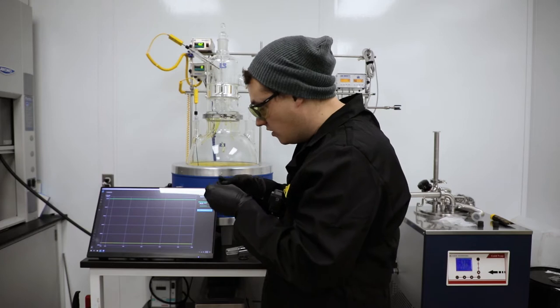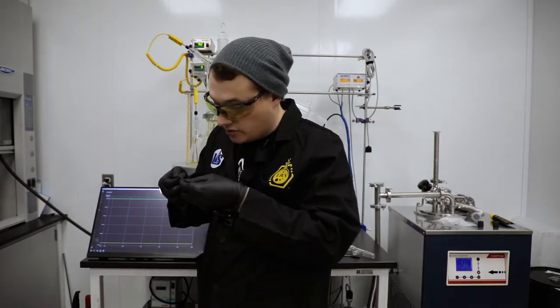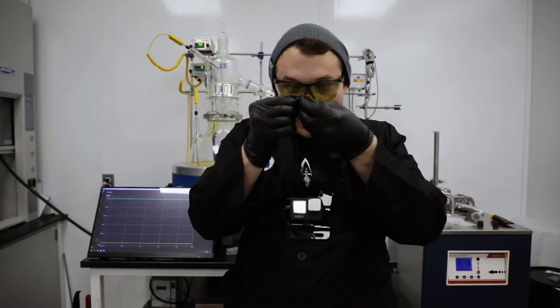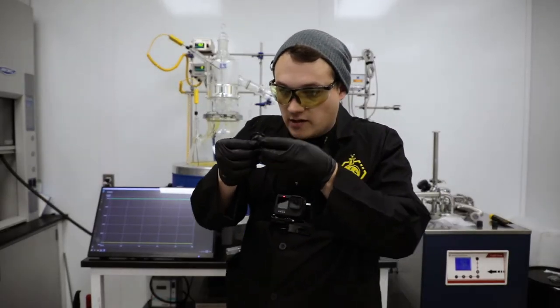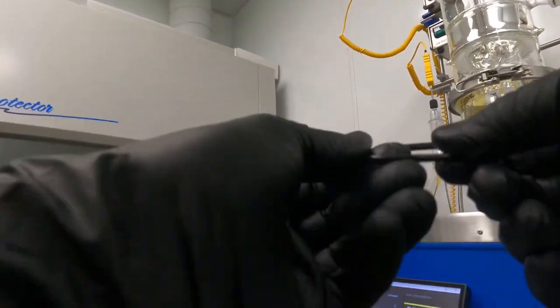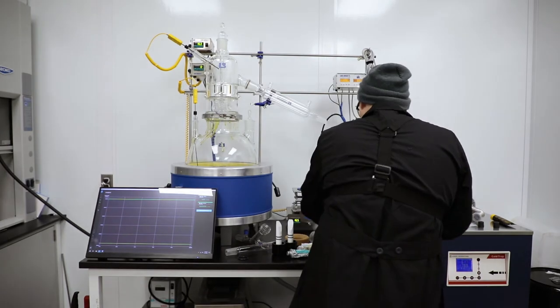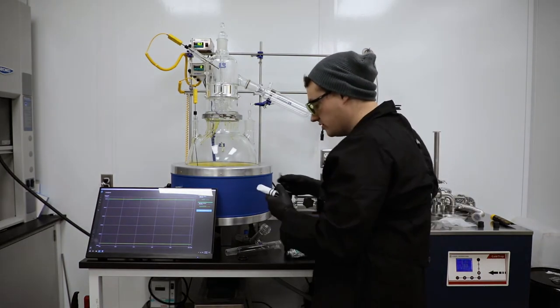Another thing we want to do is inspect the o-ring itself to make sure there's no damage. It looks like this one has a piece of the o-ring compromised — this o-ring probably needs to be replaced, but I think I can still get it to seal. I'm going to go ahead and still use it, but I would encourage you to have extra ones on hand in case you do damage them.